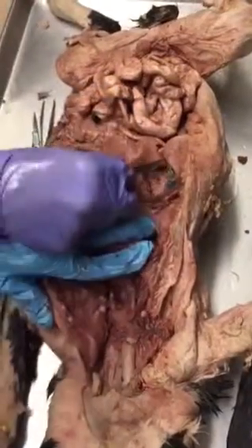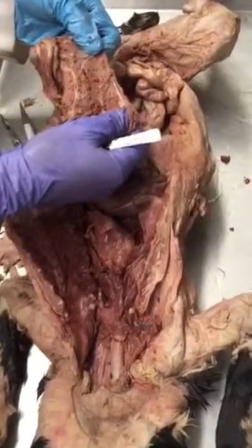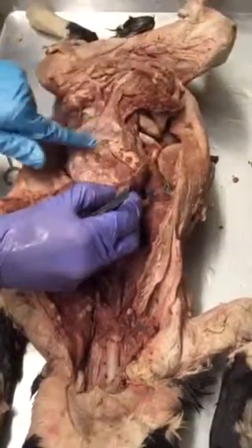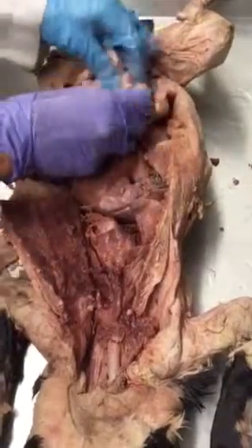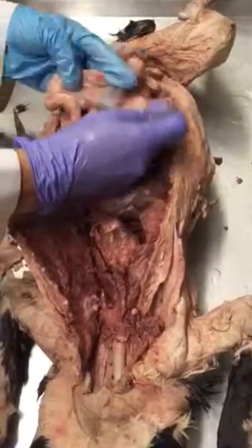Diaphragm. What's this little green guy? Gallbladder. What's this organ? Liver. What's this structure? Greater omentum. What organ is this? Stomach. What organ is this? Spleen. What's this structure? The small intestine.